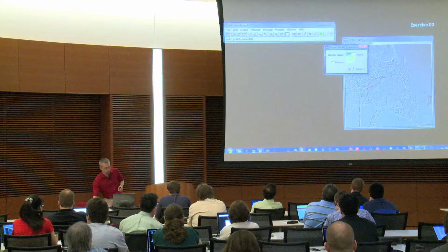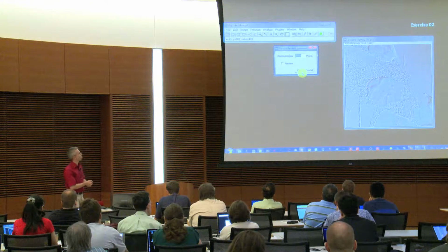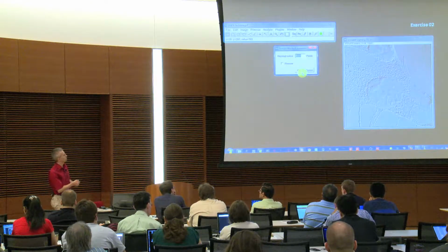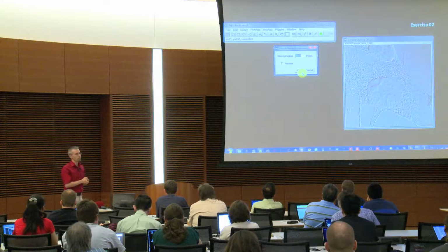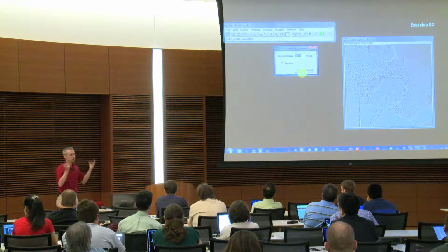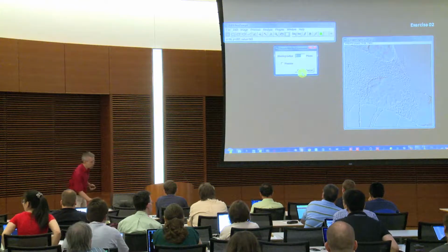And then you see that you are actually asked for a blurring function. So far the problem is that the background mostly comes up where this one is located. So a blurring radius, and the default value is 50. That doesn't mean that it's good, that's just any default value, and you need to test it. How can you test it? That's why you have a preview.